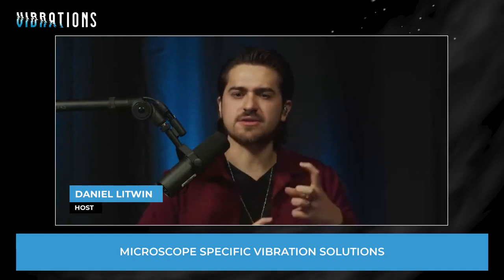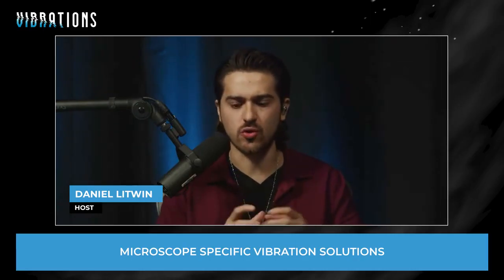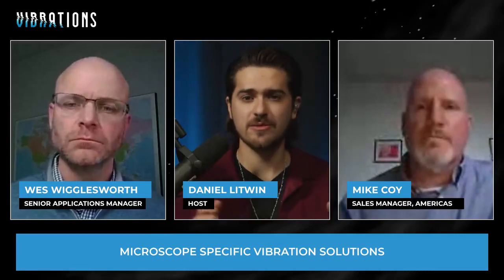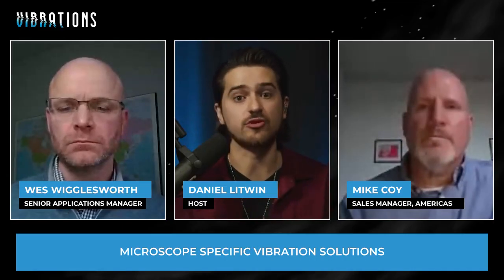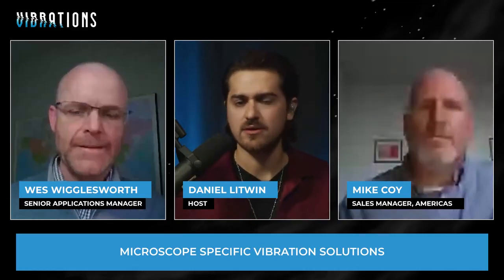Now, obviously, there's a relationship here between the microscope, the use case, and the vibration control solution, right? And those are all typically determined by different entities. You know what I mean? The environment is not producing the same microscope, nor is the vibration control system produced by the same company, for example.